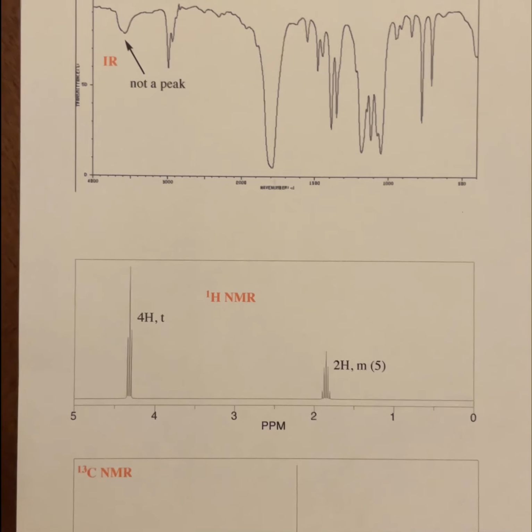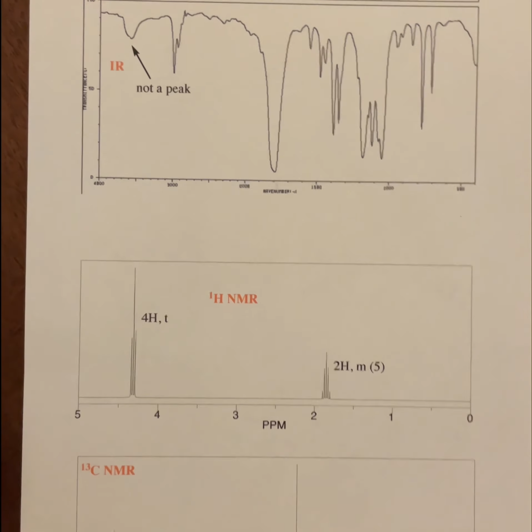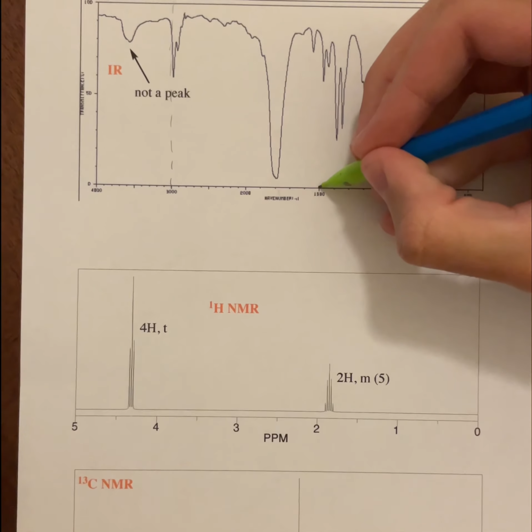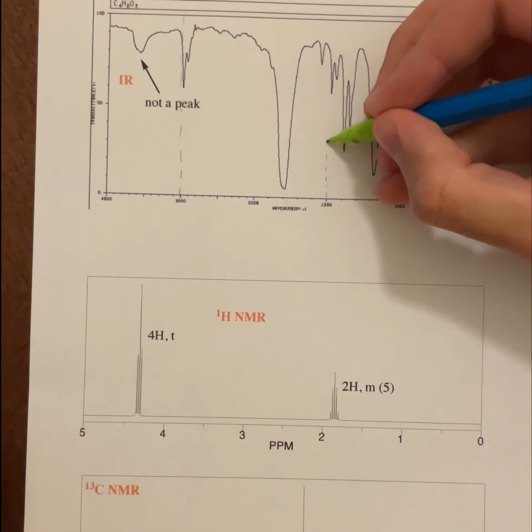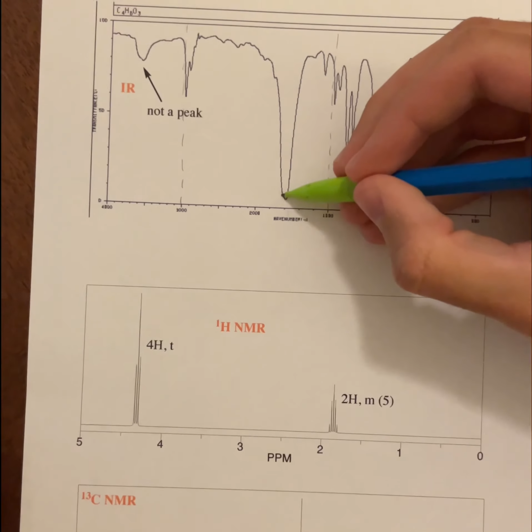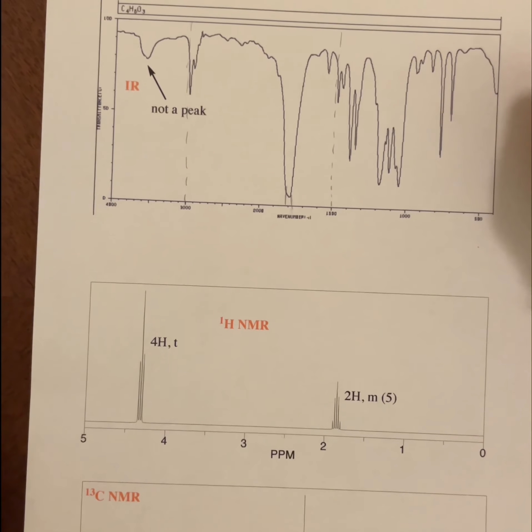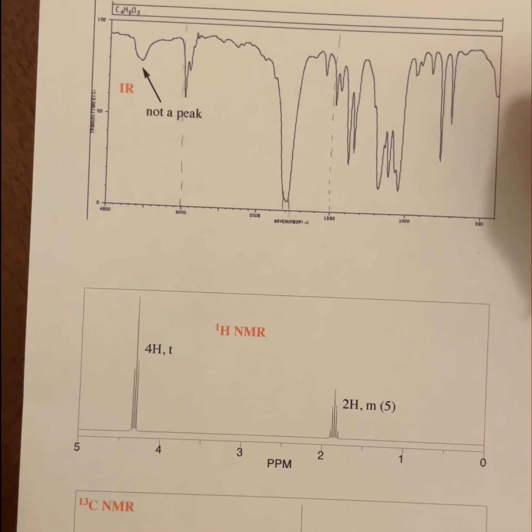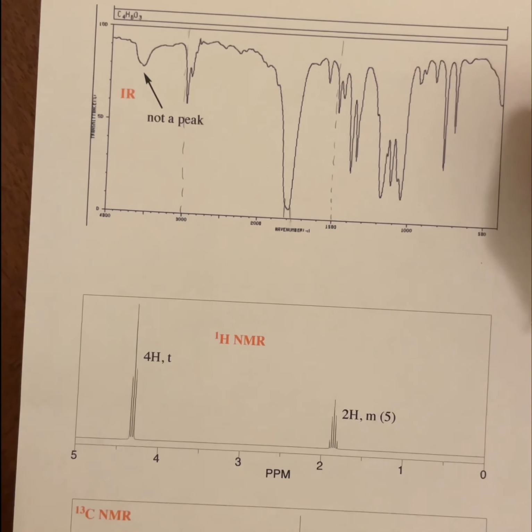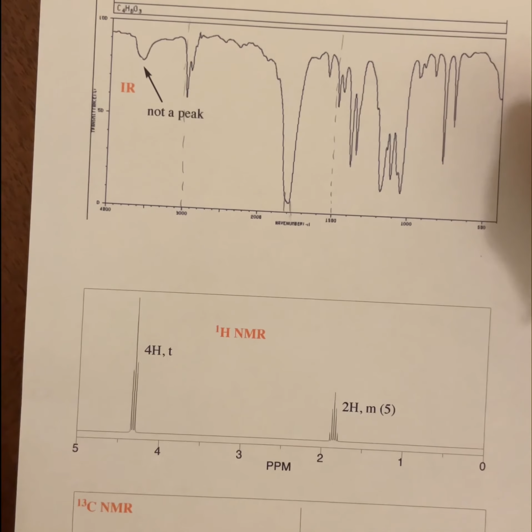So for this ALA, the first thing I did was look at this IR spectrum, and I just drew a line at 3000 and one at 1500. The first thing I noticed was a strong peak in the upper 1700 range, which suggested to me that there would be a C=O in this structure, but it was hard to tell what kind it would be to begin with.